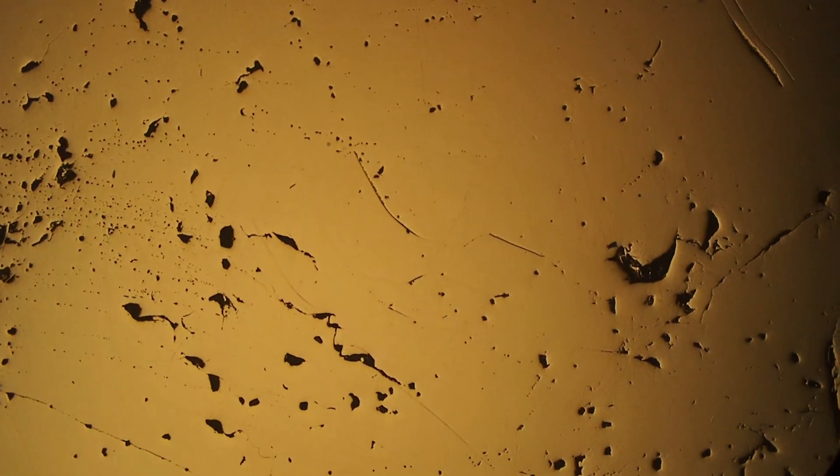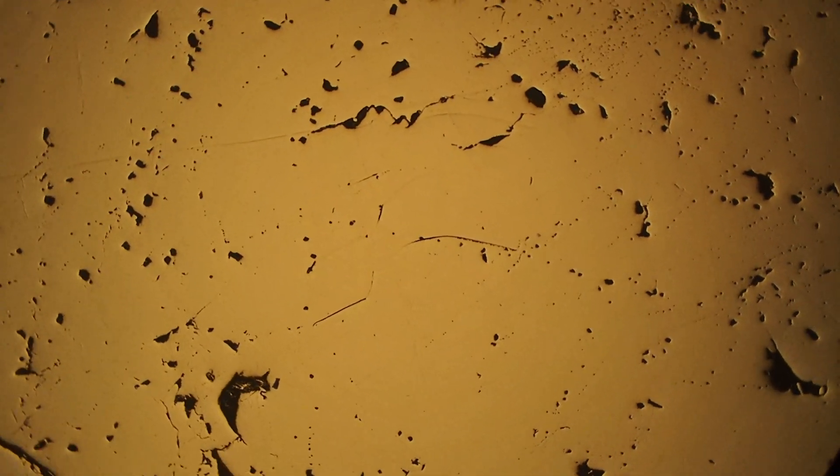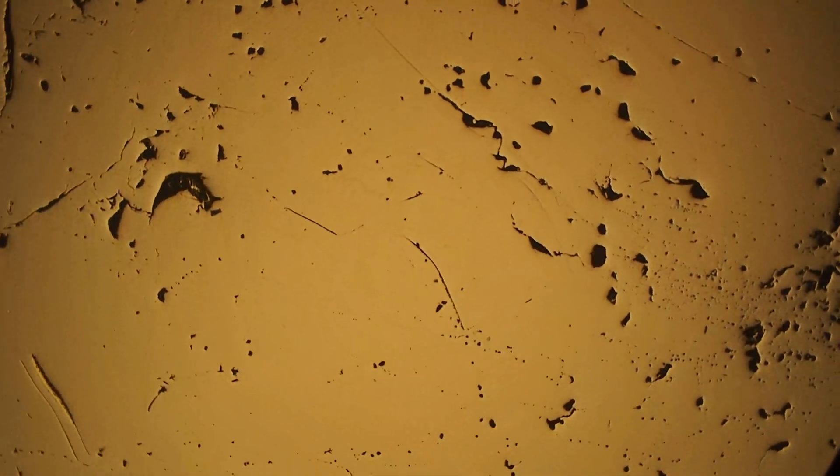As you can see, when we change or rotate the stage, we can't really see any bireflectance. Sometimes you can see it weakly, but we're not seeing it with this crystal.